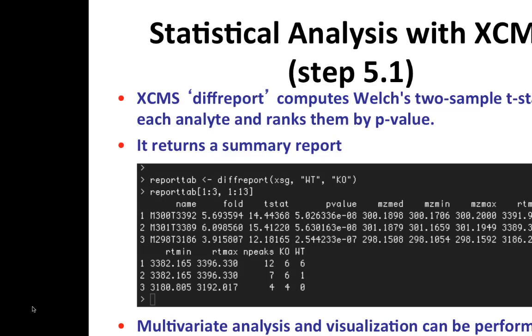As I mentioned, XCMS also has a built-in function called diffreport. It actually uses a t-test. We can do some very simple analysis here, and the more advanced analysis is for MetaboAnalyst. So we can do a simple analysis and see significant peaks. We can visualize the peaks. Okay, this is what we try to do next.